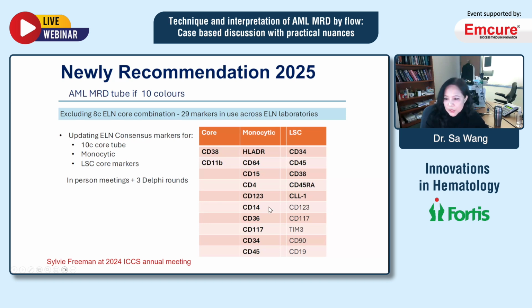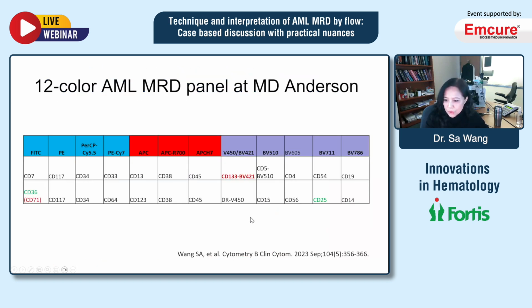This other recommendation is what we use. We published these panels in Cytometry B for validation. If you read that paper, our panel actually received FDA IDE clearance, because our clinicians asked us to send it for FDA IDE approval, since they use MRD to enroll patients. As you know, a lot of therapies target MRD. If you use MRD as an enrollment criterion, it is considered a high-risk assay, and we need to get FDA clearance.